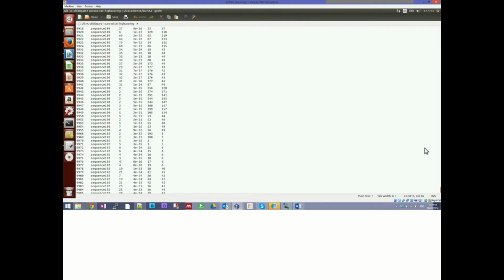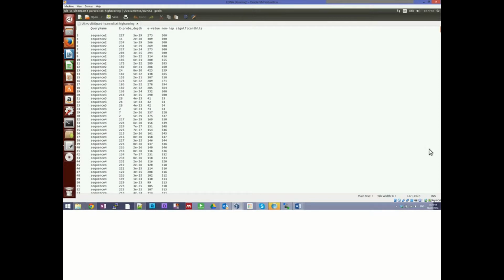So in this case, I'm going to do Control Home. So we have different, and I have enumerated these. These are the number of EPROB, number 1, number 3, number 4, number 5. This is how many EPROBs I have. Like this is the EPROB number 3, up to 10,000. Okay. We haven't named each EPROB yet, but we have an EPROB depth that, as I mentioned before, and I accept only EPROB depths that are higher than 2 or higher than 4x.